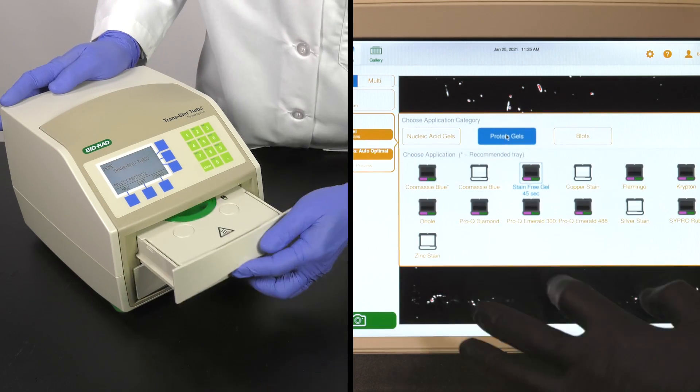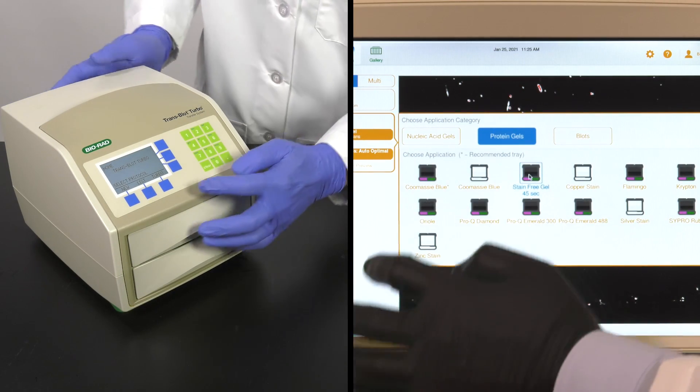Your gel is now ready for downstream applications.